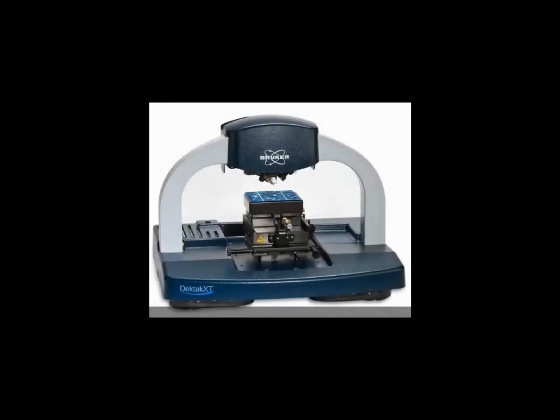A solar cell fixture can hold mono and poly crystalline solar cells of up to 150 mm square. It is easily installed on the DECTAC XT with a dovetail adapter plate.